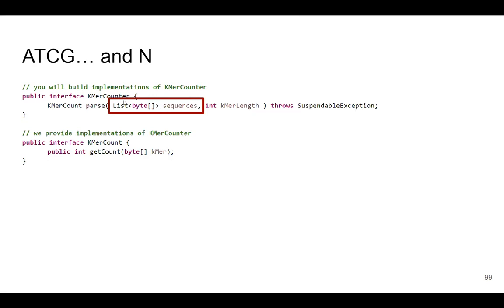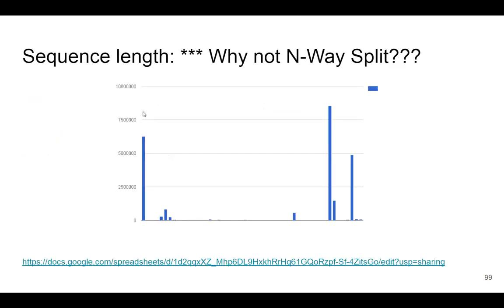And one really easy way to parallelize it would be to say, all right, just make a task per sequence. It turns out the Y chromosome has 50 separate sequences. So you're like, oh, 50 tasks, that's perfect, let me do that. But if you look at the length of these slices for the Y chromosome, this is one that I pulled from the NIH. This one is 5-6 million long. This one is 9 million long. This one is 4 million long. Just the sequences, is that right? I think that's right. Yeah.